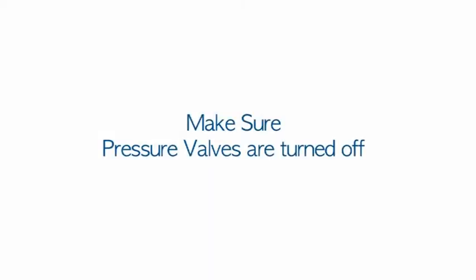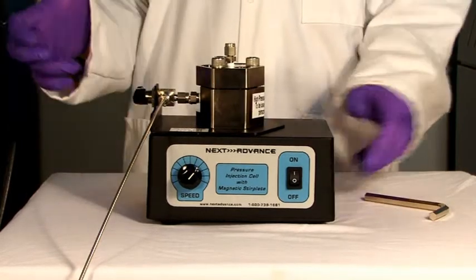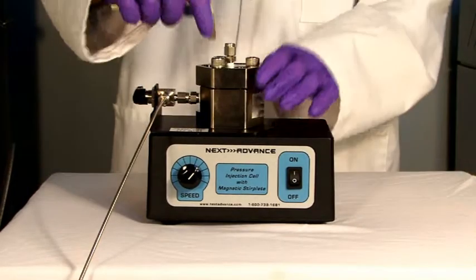Before opening the base of the pressure injection cell, first make sure that the valves at the pressure source are turned off. Next, open the three-way valve on the pressure injection cell to release any pressure from inside of the instrument.